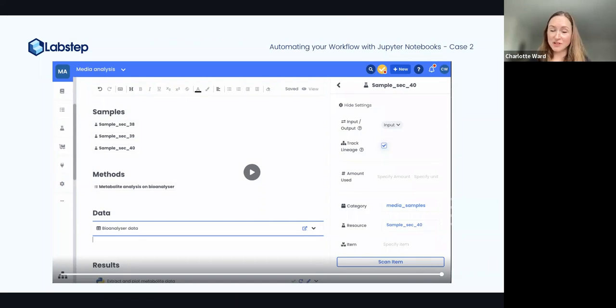But the other thing I'd like to stress is we're very much here to help. To get you up and running, we can give you some example scripts. If you've got particular things that you want done, you can contact us and we can do things for you. Or if you just want a bit of advice and help, we're also here. We've got the whole customer success team, and we also have an implementations team that deal with these scripts.